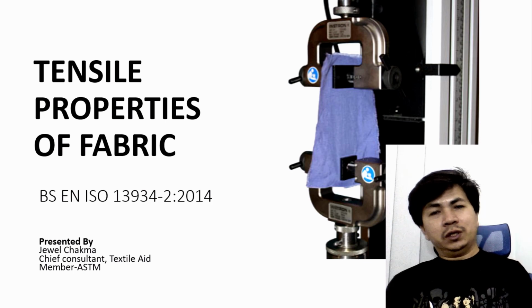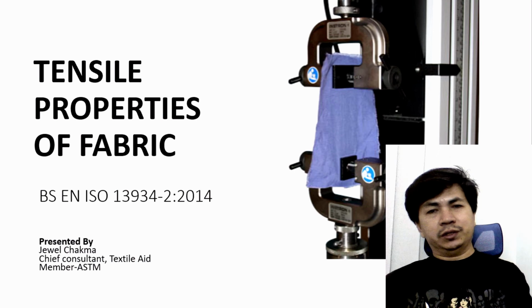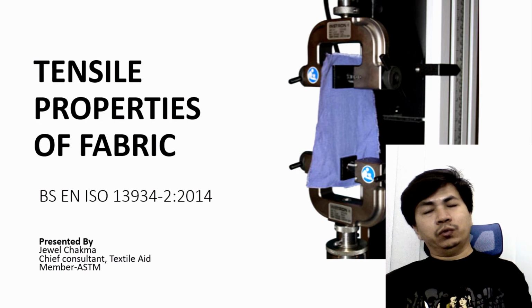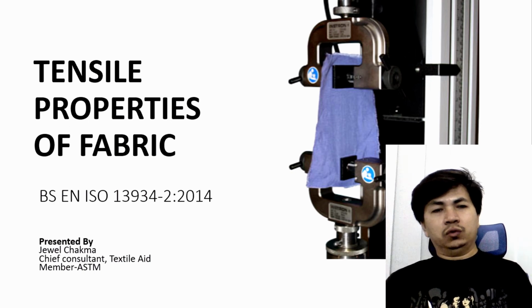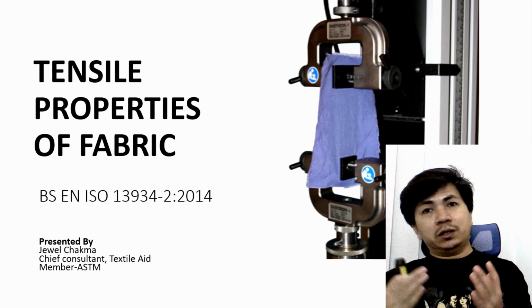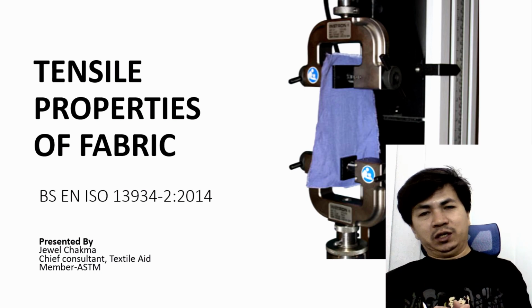Most of you know that in general, I discuss and clarify the international standards of textile testing. Today's process is the tensile properties of fabric, for which the international standard is BS EN ISO 13934 part 2. So what are the tensile properties of fabric? The tensile properties of fabric are known as tensile strength.